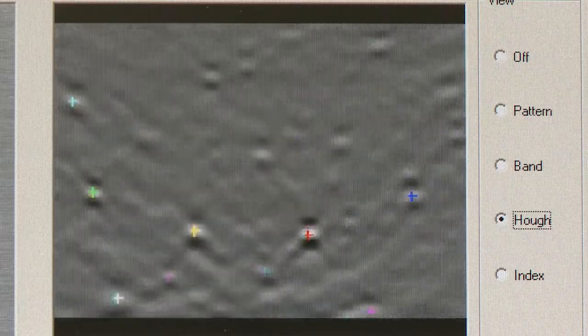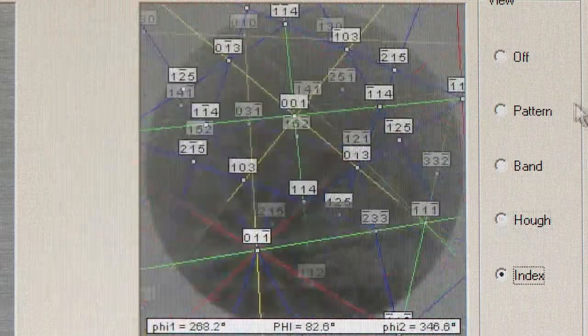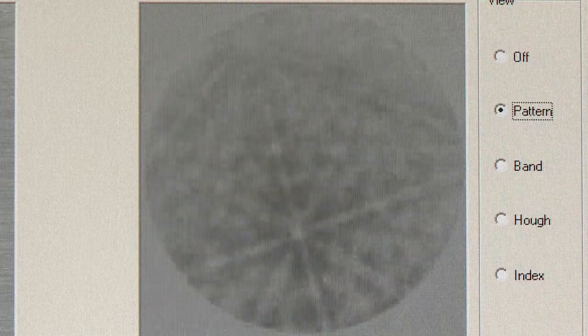The EBSD technique can also differentiate between compounds that have a similar composition, but different crystal structure. For example, one of the most commonly used titanium alloys, TI-6-4, can have two different crystal structures, called phases.